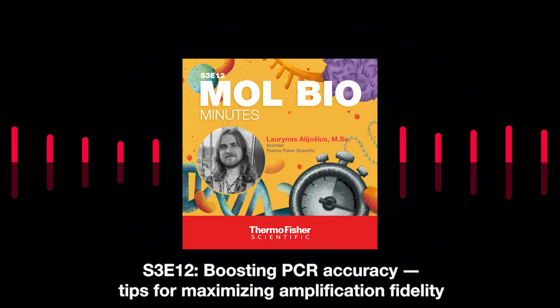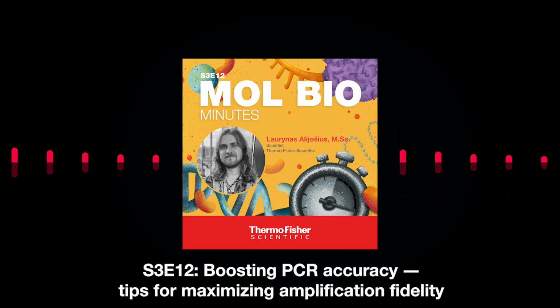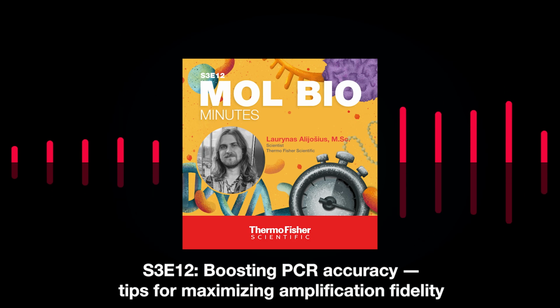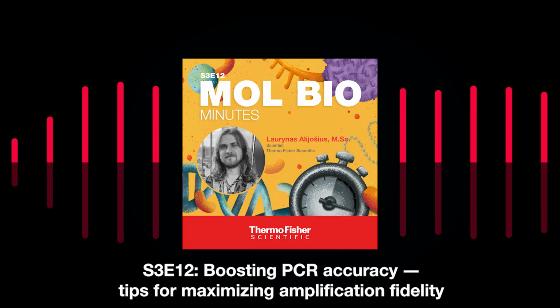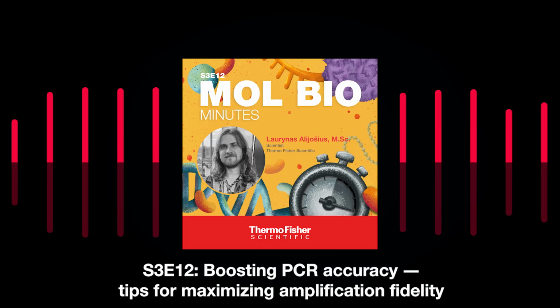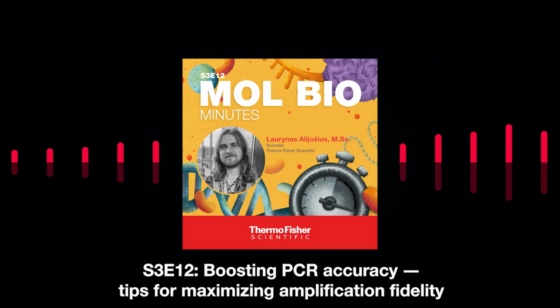So, some time ago, I wanted to make some specific DNA to use for my model system for my experiments. I did some PCR from a biological template, then I cloned the amplified DNA, and then I sequenced it. But it turned out that my DNA was wrong. It had multiple errors in the sequence. I was thinking, what should I do then? Should I replace all the wrong nucleotides one by one, or should I just redo all the experiments from scratch and expect that I will get better results next time?